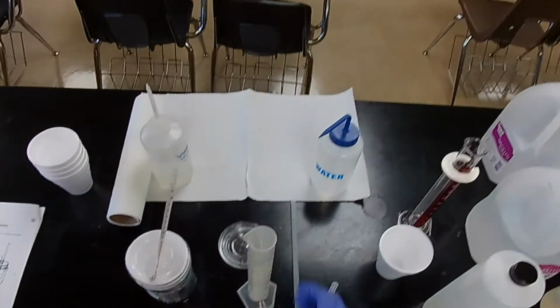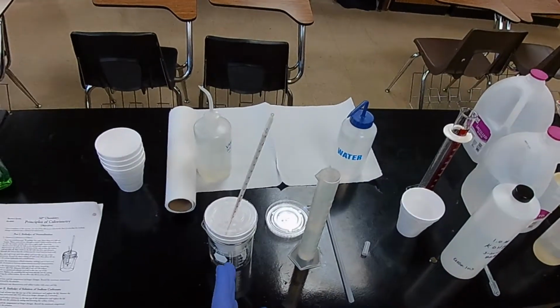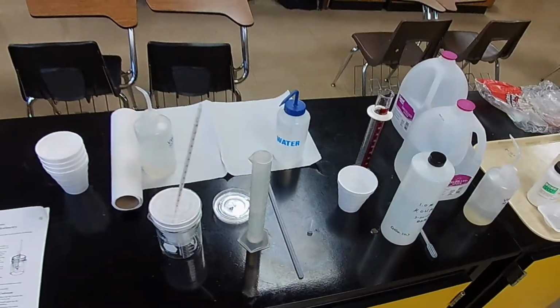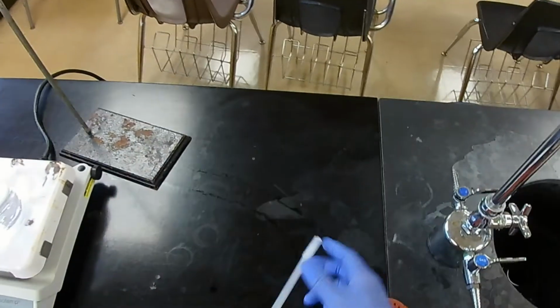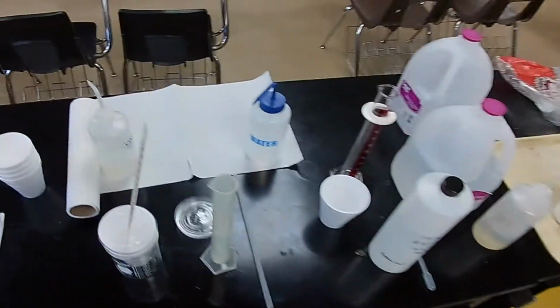Now, if the initial temperature of both potassium hydroxide and sulfuric acid are identical, that makes our calculations so much easier. So let's use the other thermometer to measure the temperature. And this is the initial temperature for both, we hope.